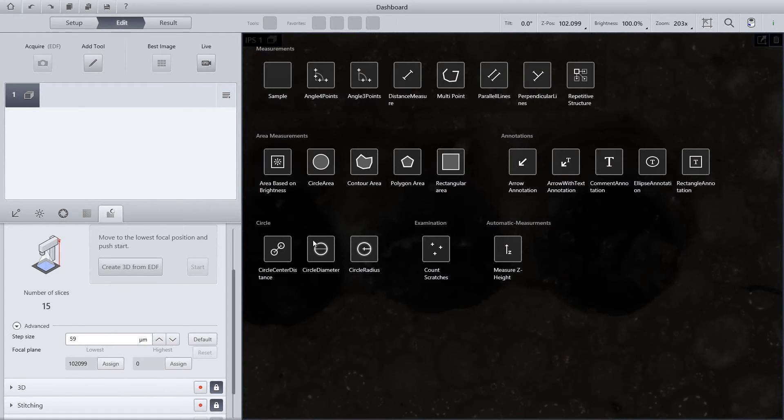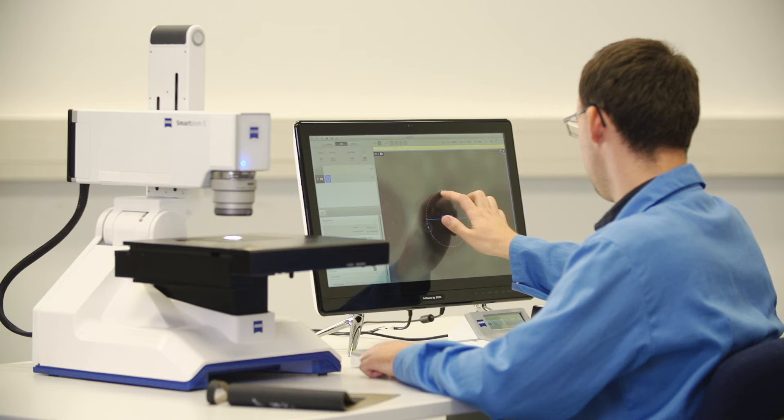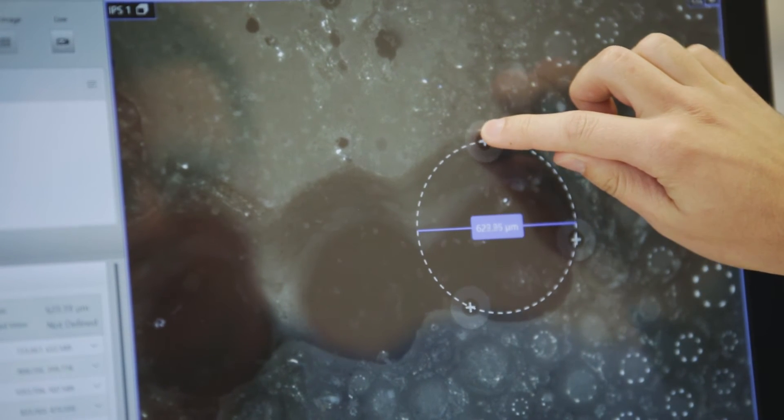All measuring options are clearly laid out and easy to use. You can measure precisely in line with your quality control plan.